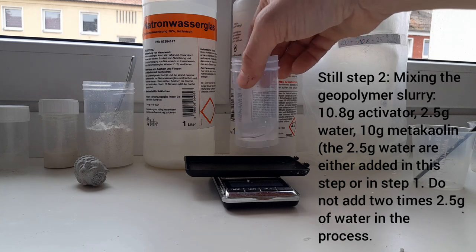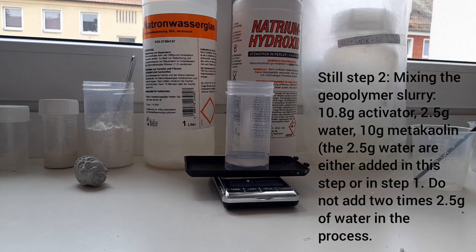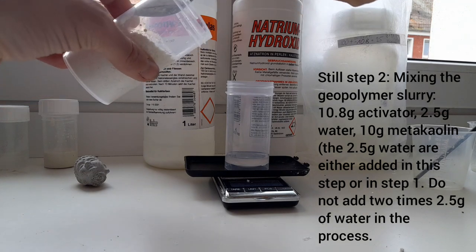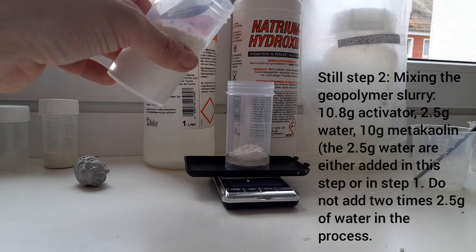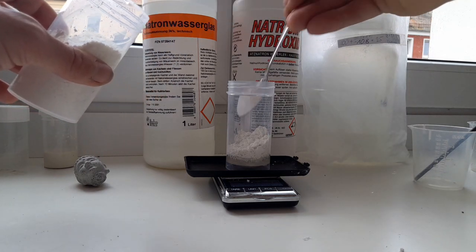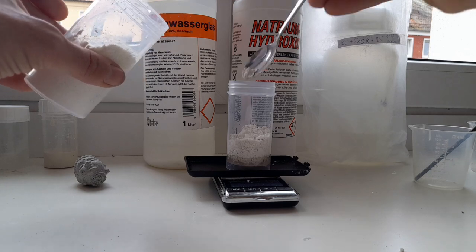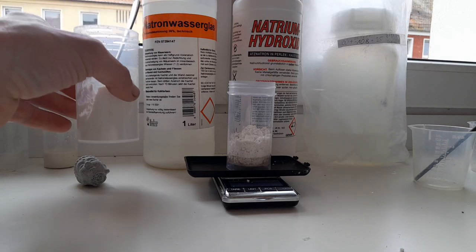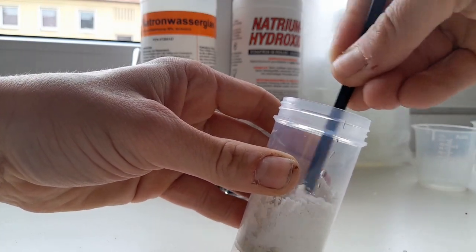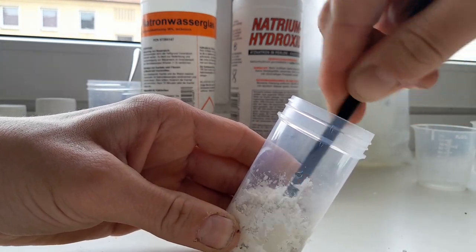What I mean is to add the water at this stage, not in the beginning of the solution — though many people do it the other way. Now we can add our 10 grams of metakaolin. Metakaolin is quite fluffy so it looks like a lot, although it's only 10 grams.